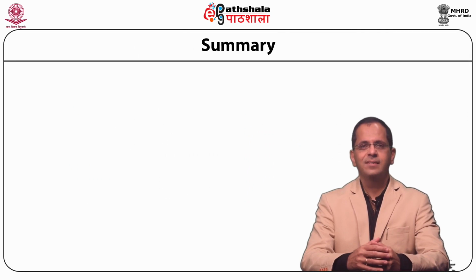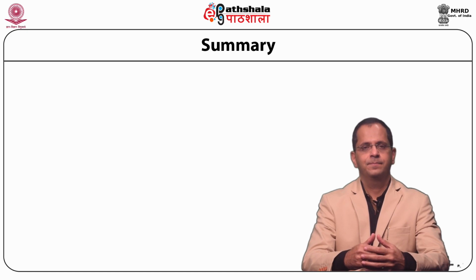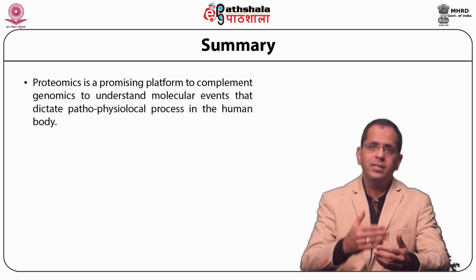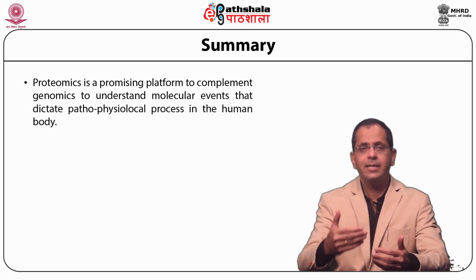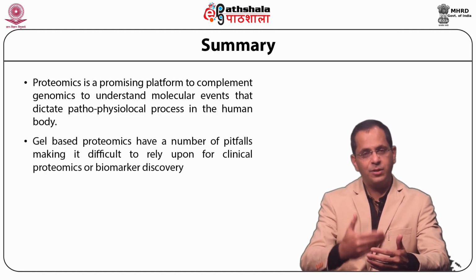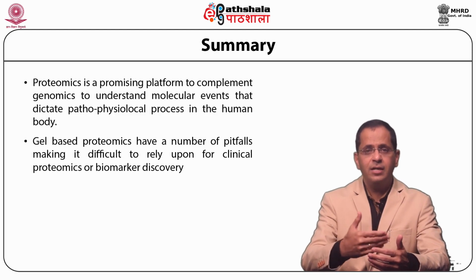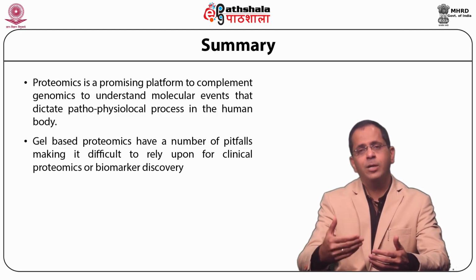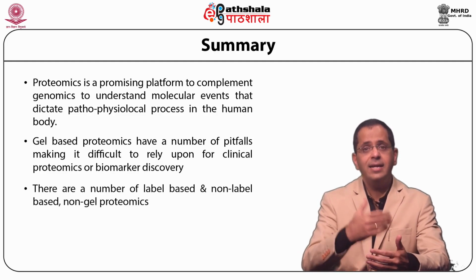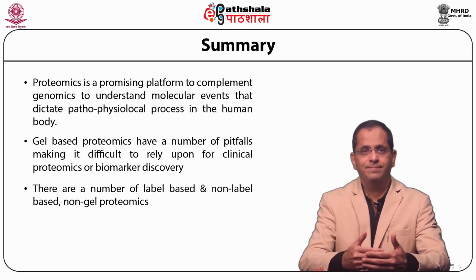So students, let us now summarize what we have learnt in this particular module. Proteomics is a promising platform to complement genomics to understand the molecular events that dictate pathophysiological processes in the human body. Gel-based proteomics has a number of pitfalls, making it difficult to rely upon in clinical proteomics or biomarker discovery. There are a number of label-based and non-label-based non-gel proteomics approaches.